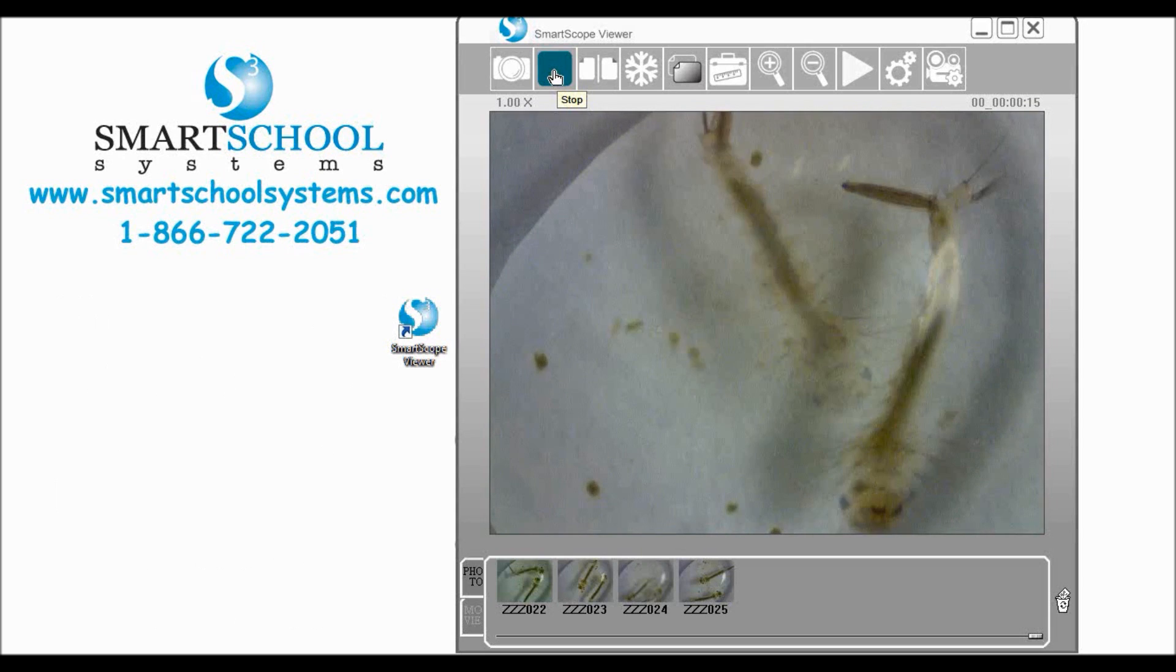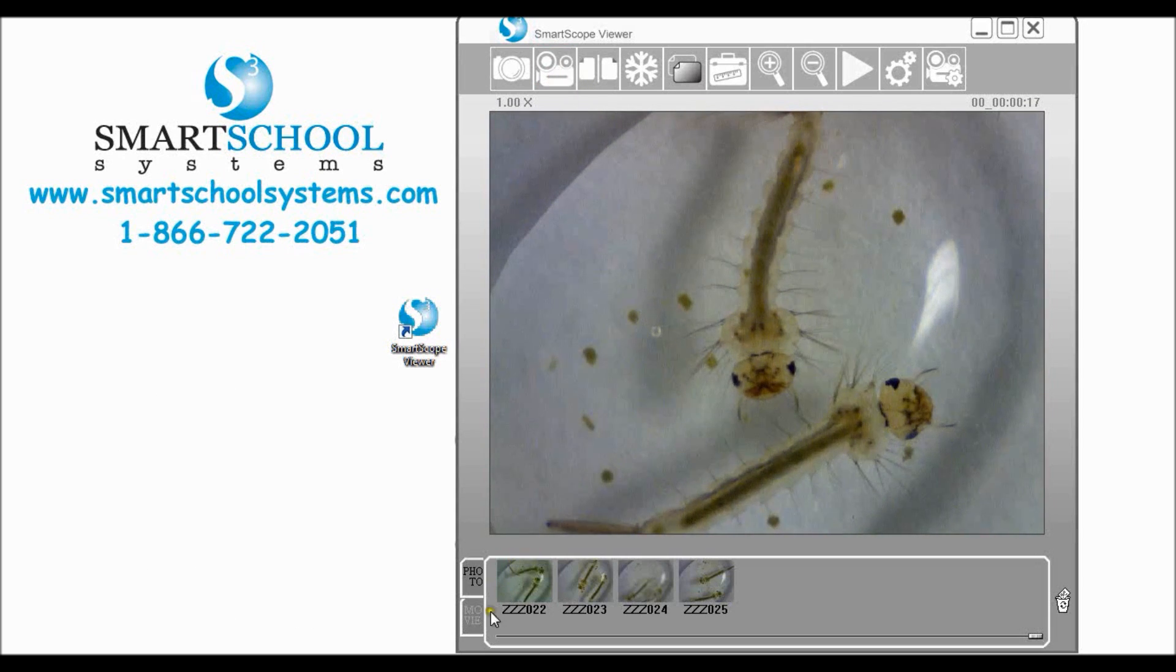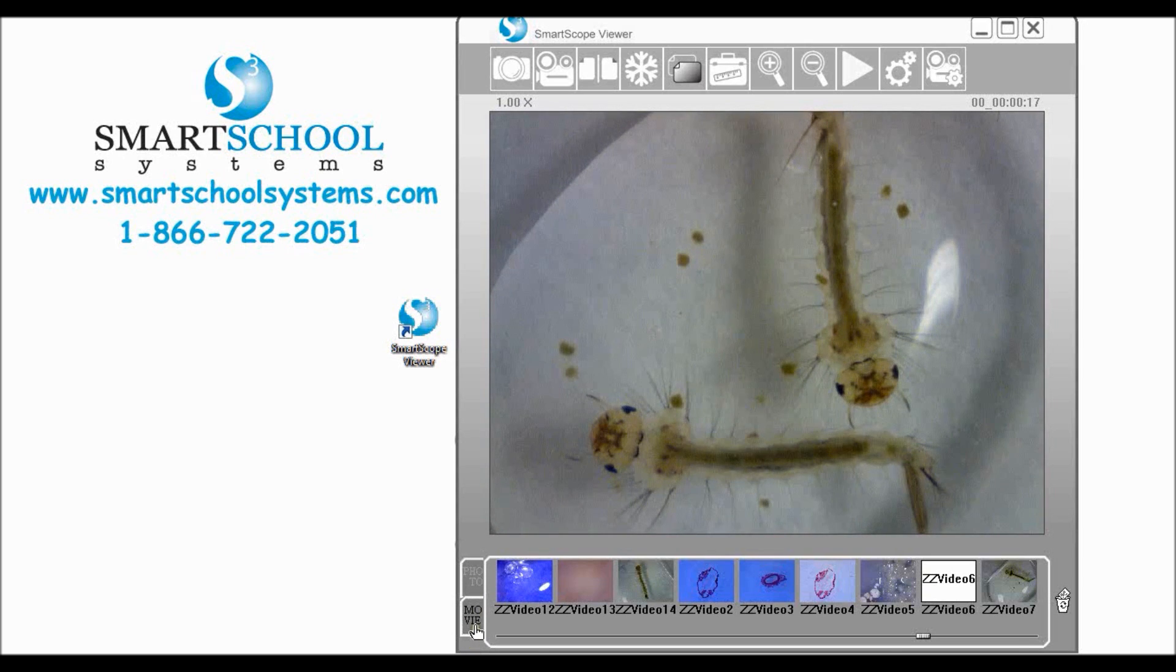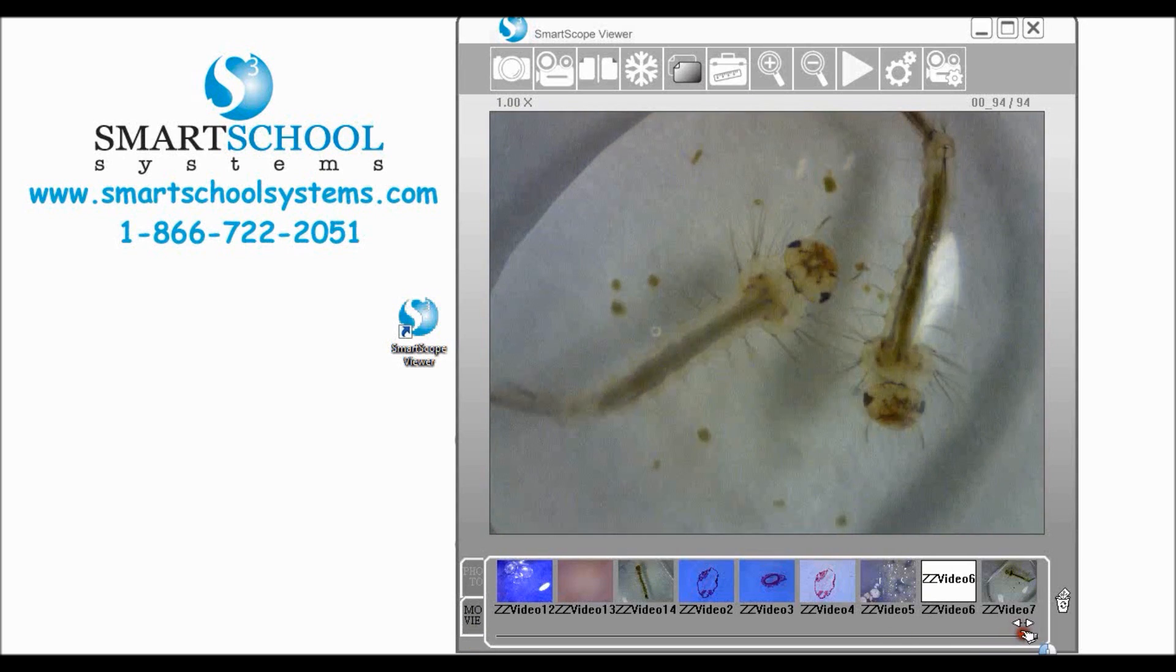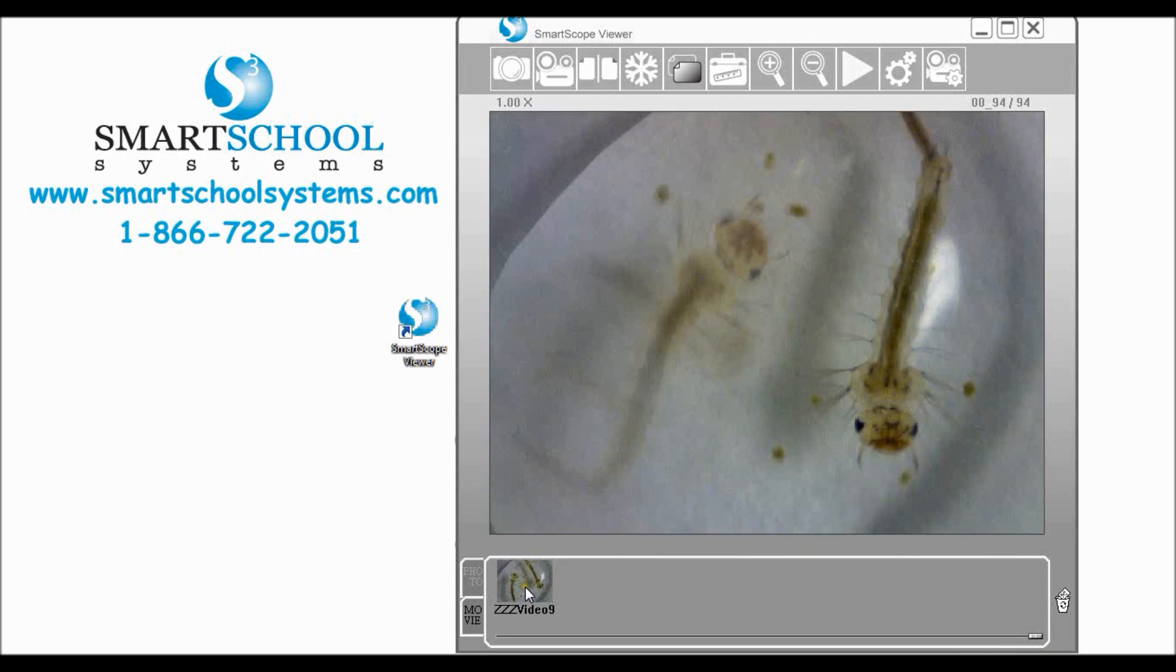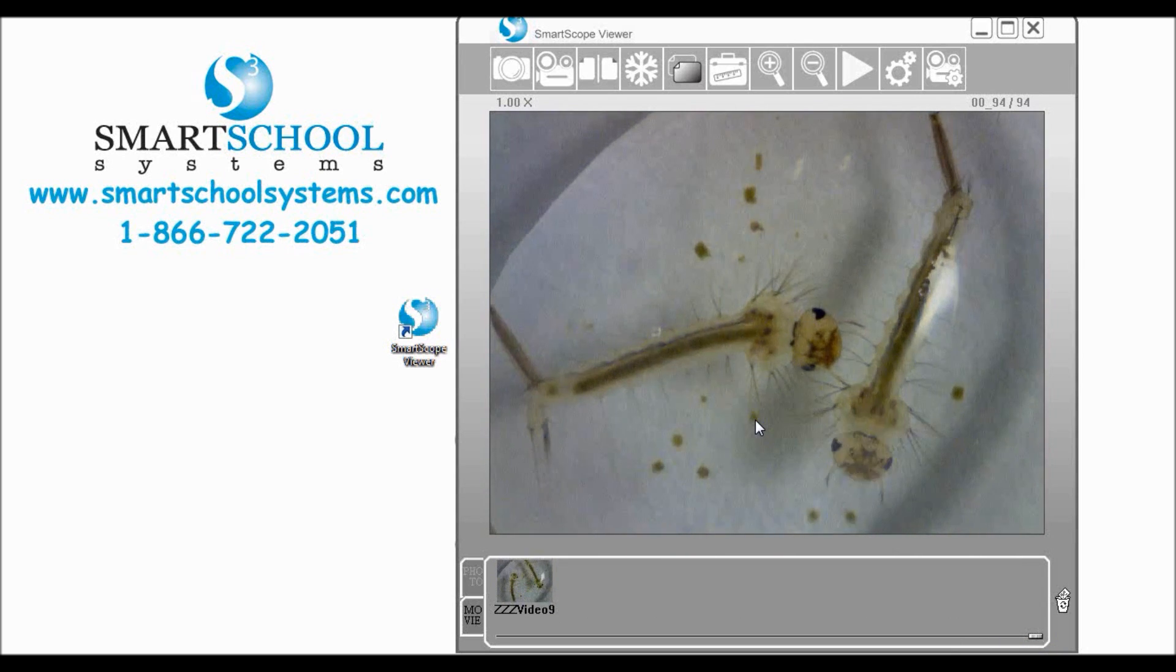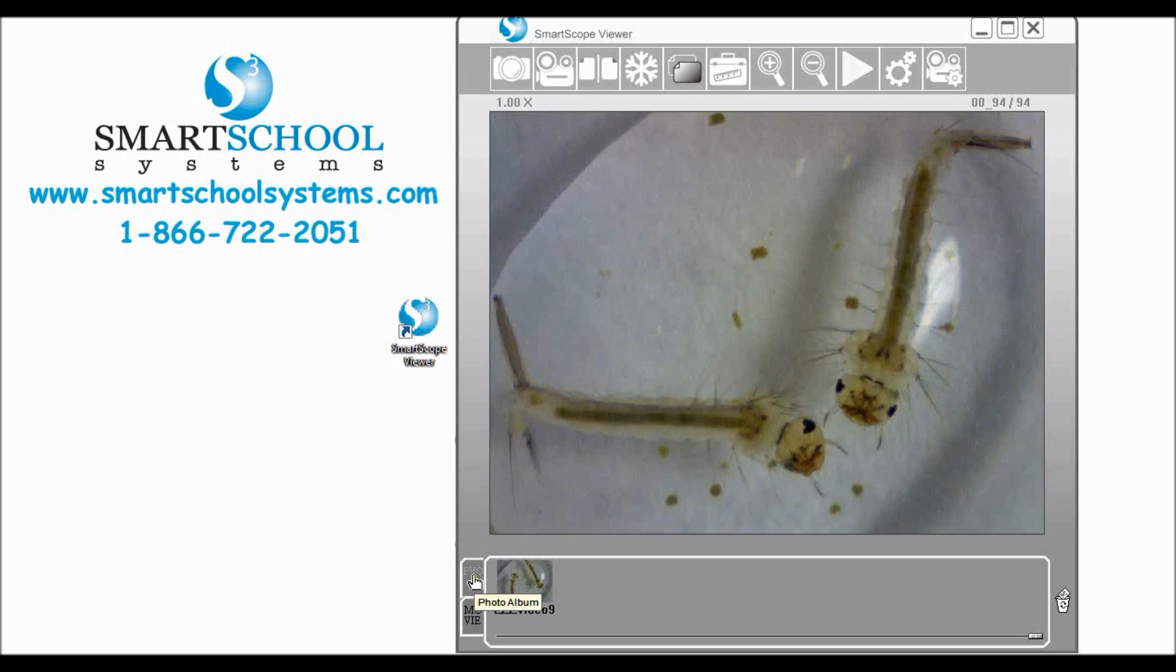When we're ready to stop we simply click stop. If we want to view our video we come down here to our movie tab and we can scroll all the way to the right and we see our most recent video and we could drag this up into the viewing window to view it within the software in the same way that we did with our photos.